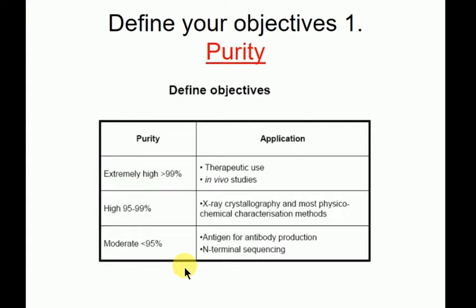You do need moderate purity. Where would that be useful, right? Where would N-terminal sequencing be useful? It would be when you have an activity that's related to a protein and you need to know the identity of it and mass spec is failing. So you then N-terminally sequence it. If you've got a really pure sample, your reads are going to be good. You could probably read 15 amino acids, and then you could work out what protein was giving you that activity. So N-terminal sequencing is from the older days of biochemistry, but it would still be informative.